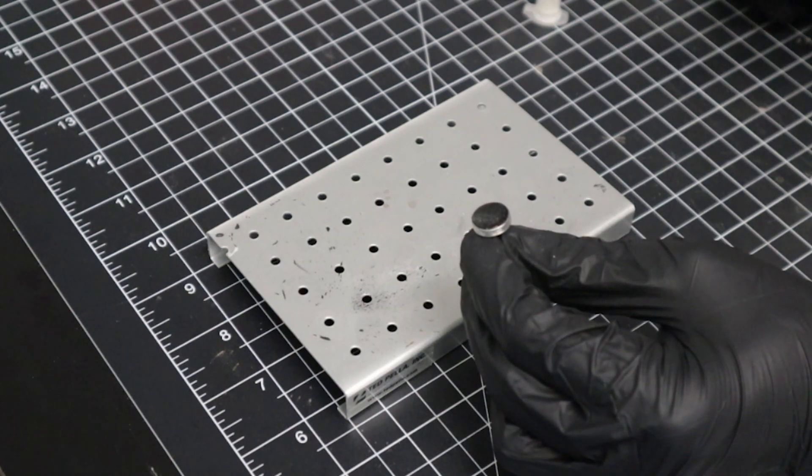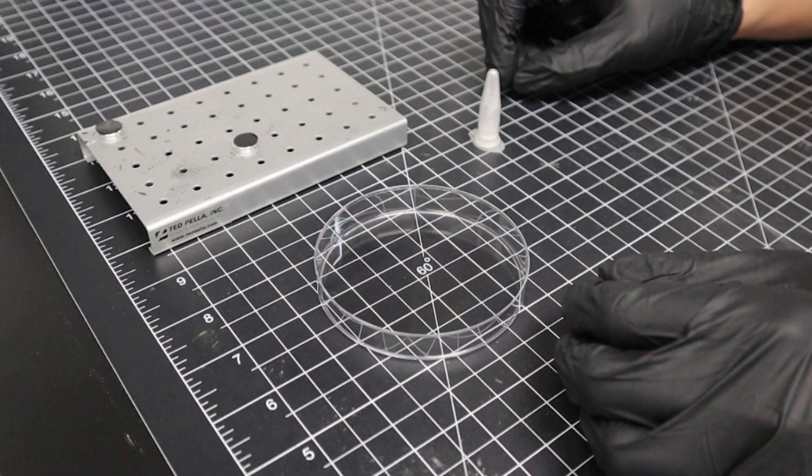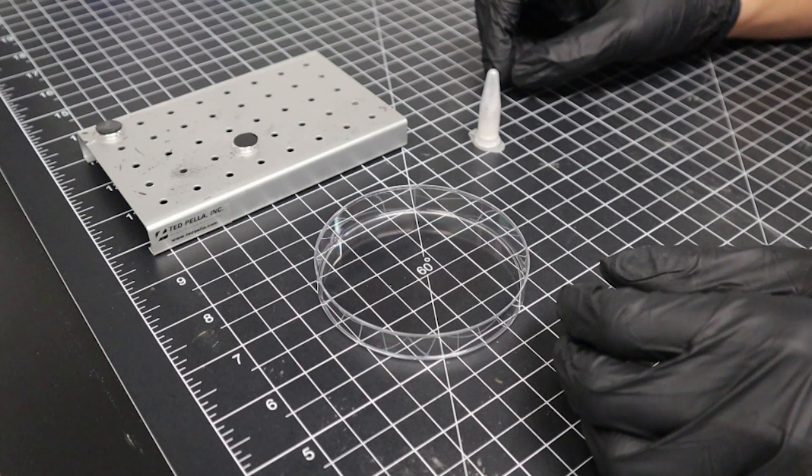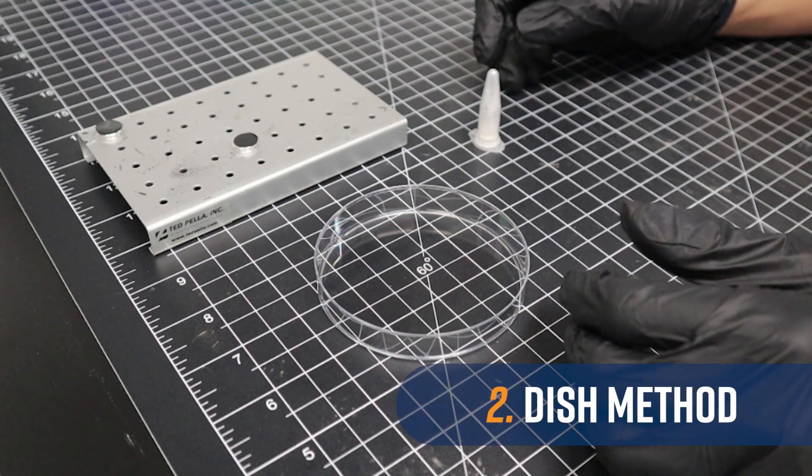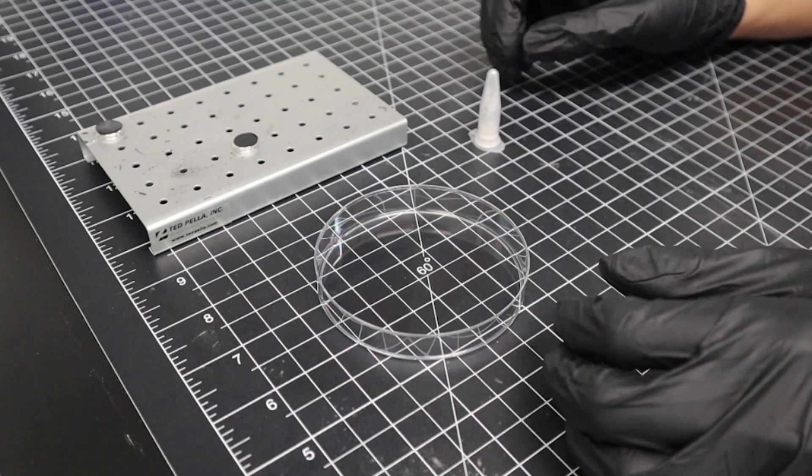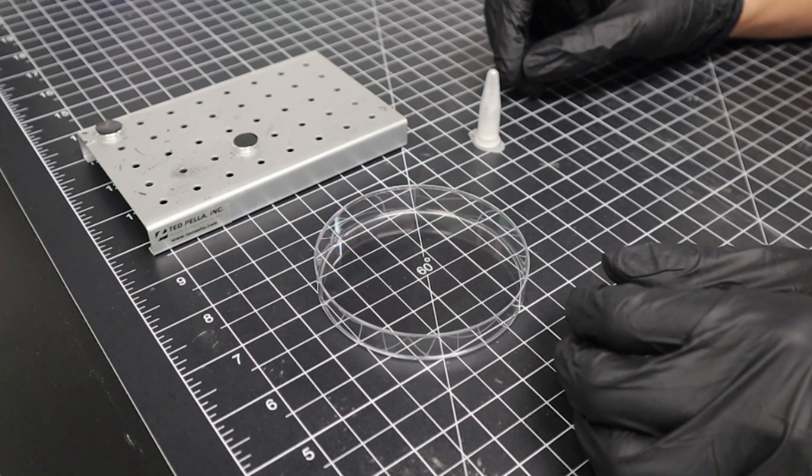Next, we'll take a look at the dish method. For particles ranging from 500 microns to 1 micron in size, the dish method of sample preparation is an excellent option. It is incredibly simple to execute, even more so than the flick method.